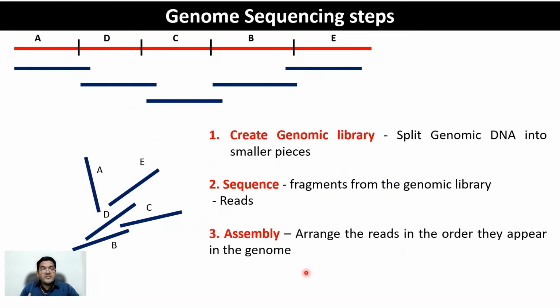So this is the problem with genome sequencing: it is really challenging. You want to understand the sequence of nucleotides in a given piece of DNA which is much longer. And we're talking specifically of the human genome, 3.2 billion base pairs, right? So the challenge is huge, and the technology you have can give you only 900 bases in one reaction. So you have to read the entire 3.2 billion base pairs, 900 base pairs at a time, right?